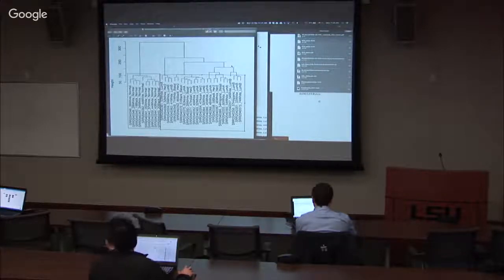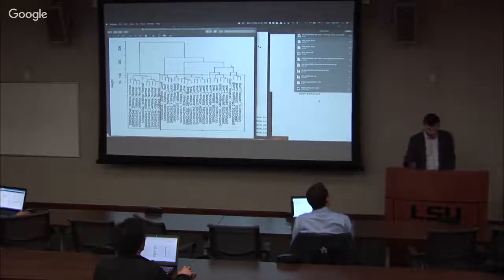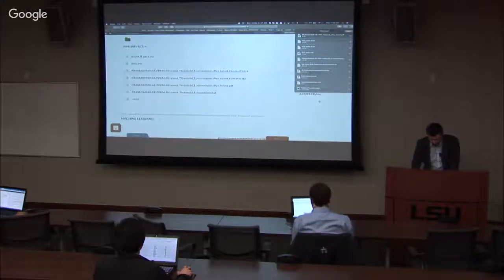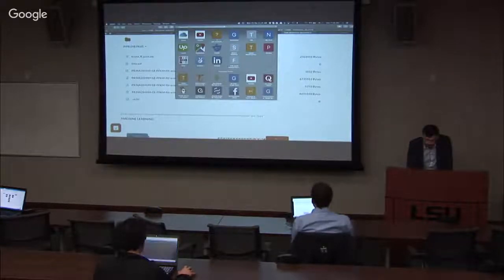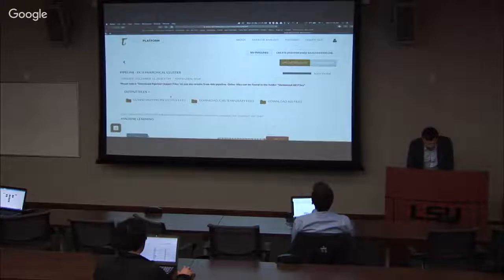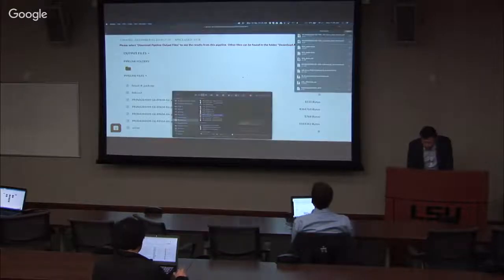So now, can you give me the pipeline ID? 7943. So what you see here is the result from normalized, and he ran for, what is it again, 388? Where is it? I can see that. Right here at the top. 7943. So if I just change this, I will see his results. And this is the result from non-normalized.